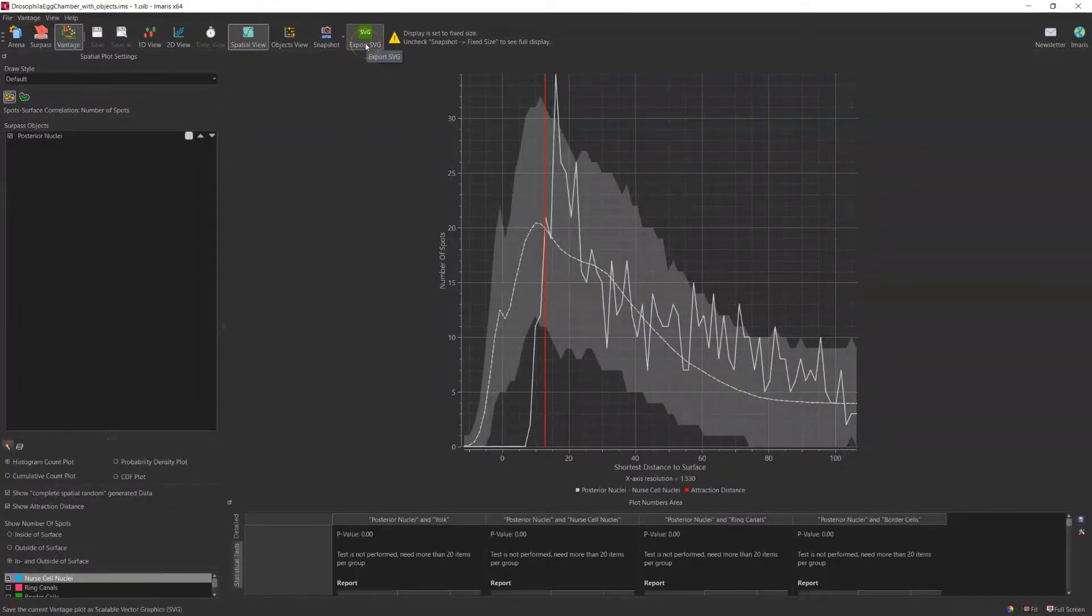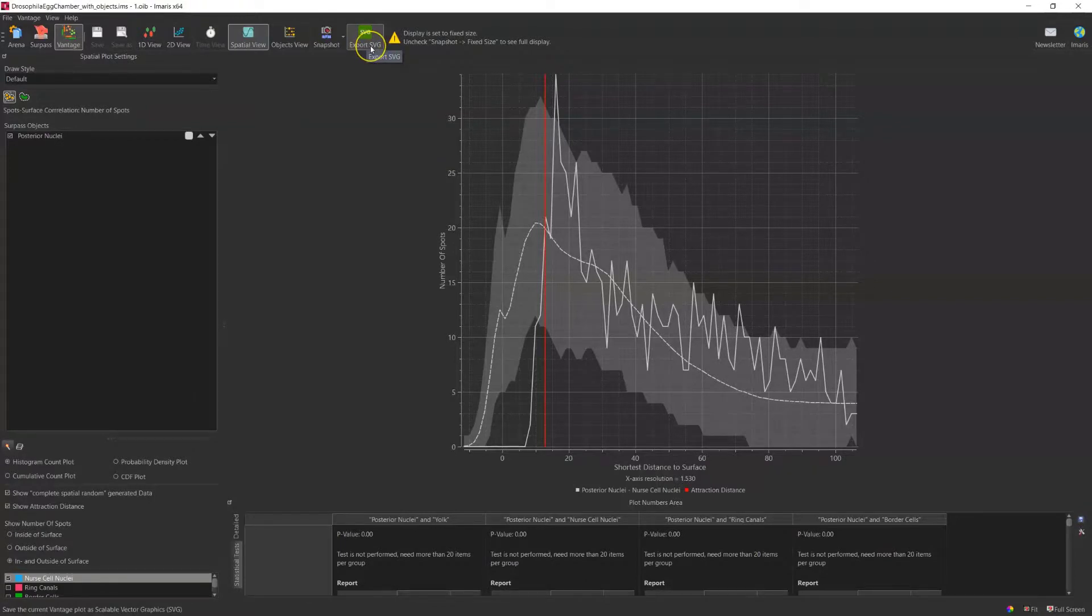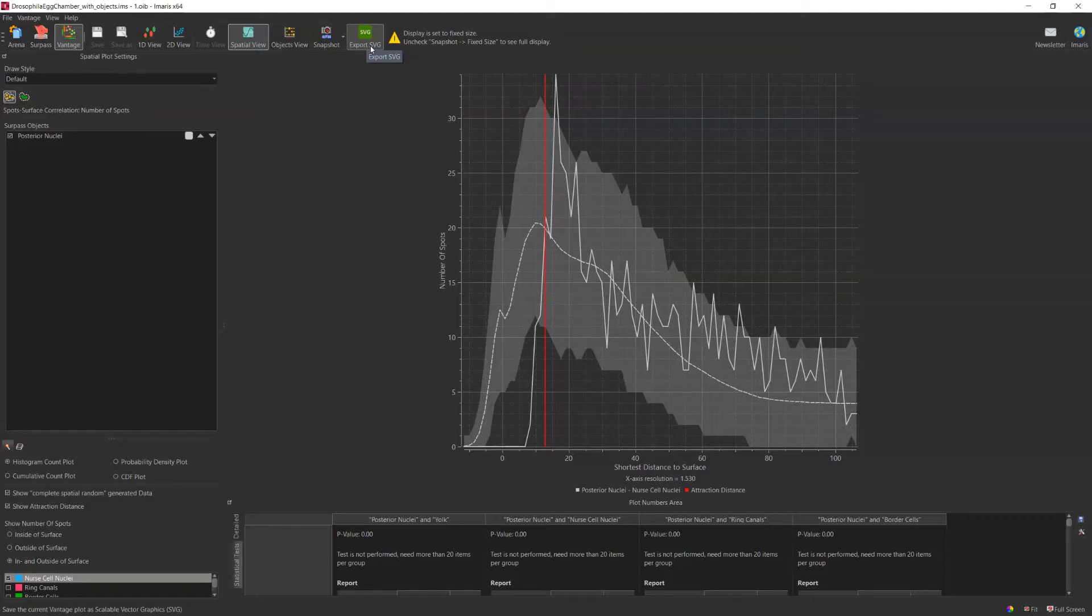Amaris also provides the option to export SVG file format or scalable vector graphics. This option allows better preservation of the graphs.